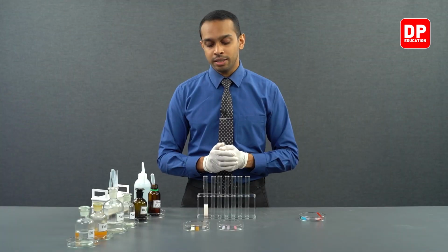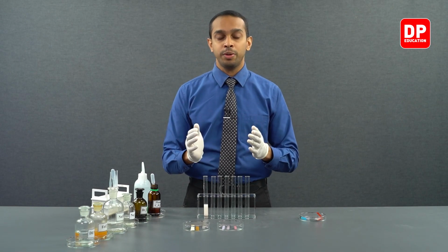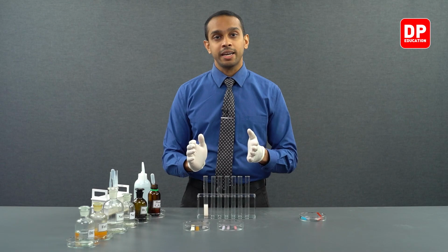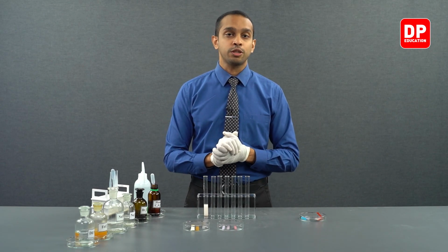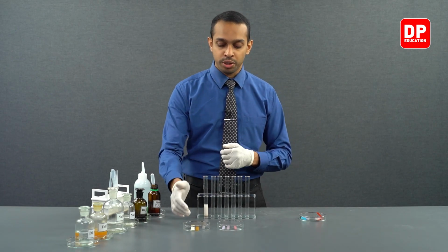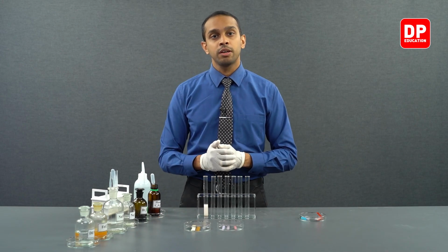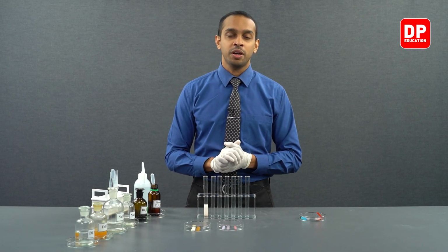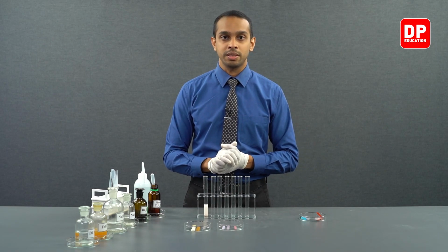Then we moved on to adding the phenol solution onto a pH paper, and the pH paper turned to an orange color, a color between red and yellow. This indicated the pH of the phenol solution is somewhere between pH 3 and pH 5. Now, let's move on to the next part in this experiment.